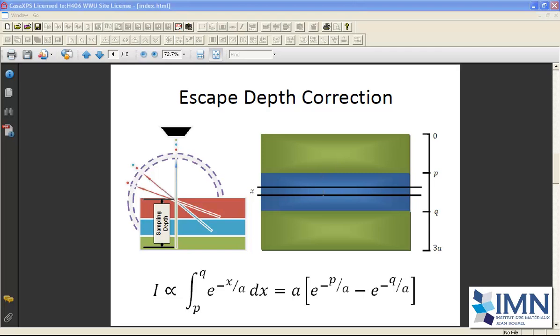What happens when an electron is ejected from an oxygen atom within the sample is that the electron must traverse the sample before entering the vacuum, and en route it may be inelastically scattered, meaning that energy is lost, and therefore the electron that originally started out with the energy of an oxygen 1s electron emerges into the vacuum and is recorded by the analyzer at a different energy. And actually this is the source for the background in the XPS data.